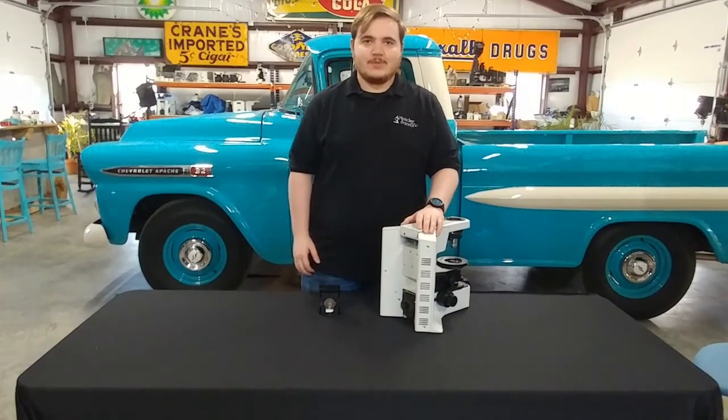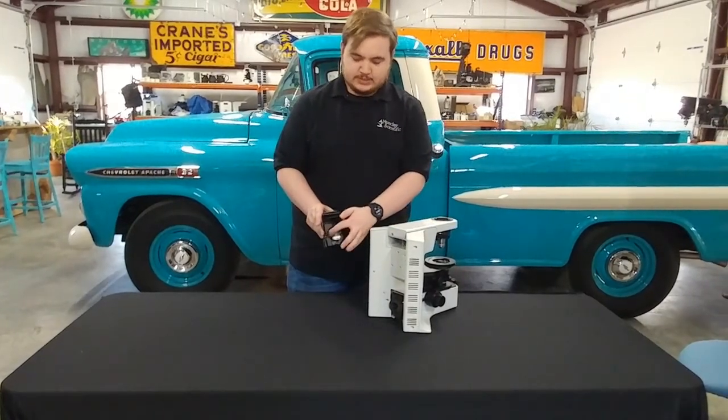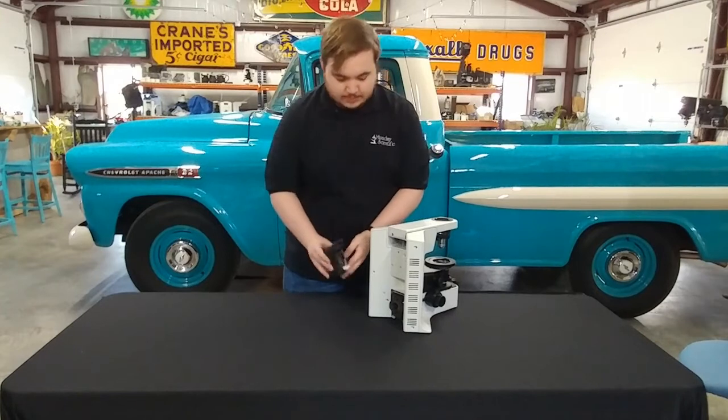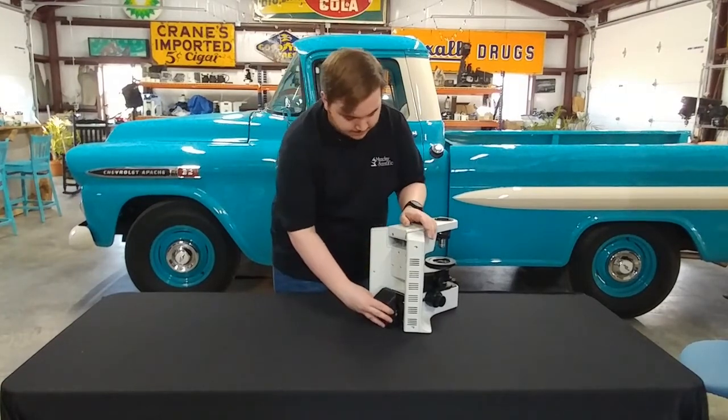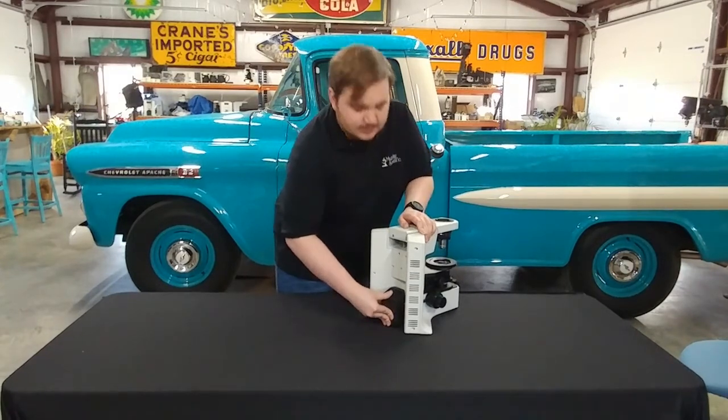Now we're going to go ahead and reinstall the lamp house. Simply take your lamp house — note the two pins on the side — and line these up with the two sockets on the microscope. Place them both inside and push in firmly.